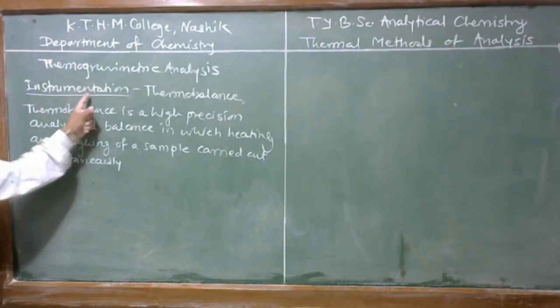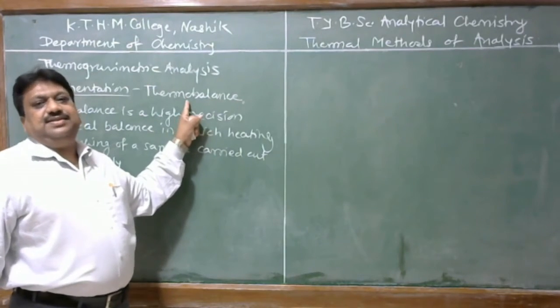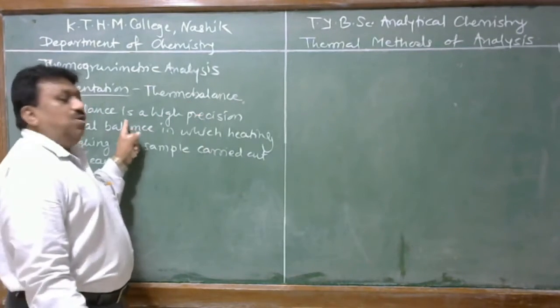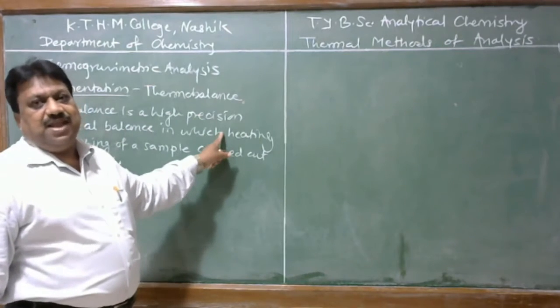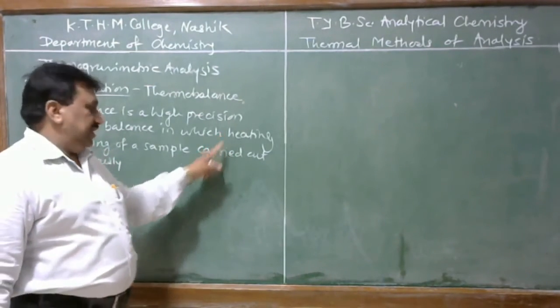Therefore, the instrument required for thermogravimetric analysis is the thermobalance.